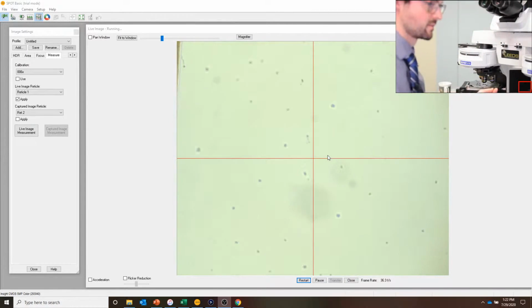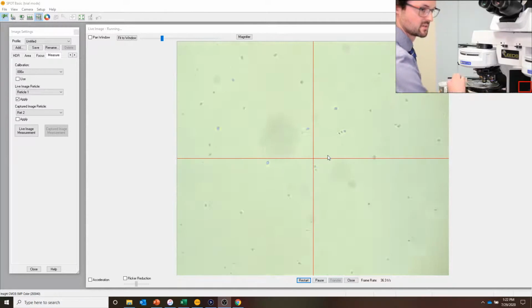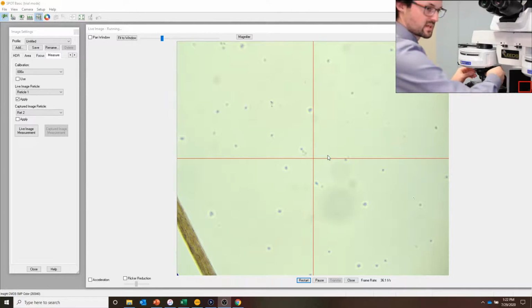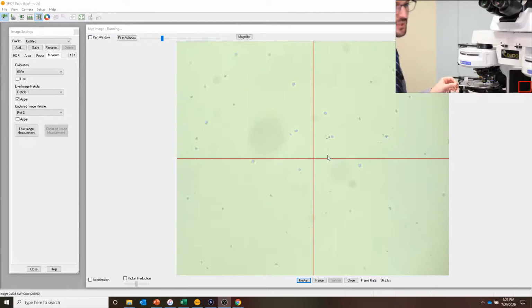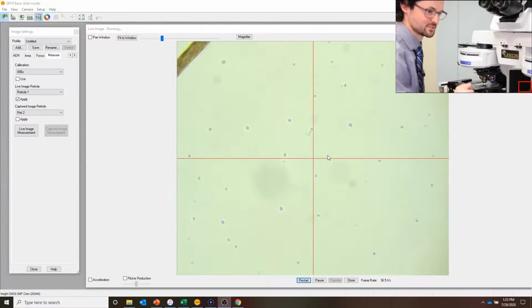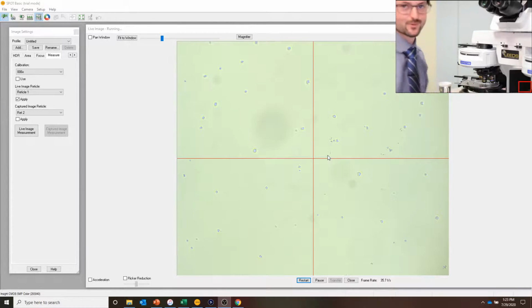And so now, not using the centering screws in the back, but using the centering screws on the nose piece that I've inserted, what I'm going to do is try to get into the middle of that circle. Maybe I overshot a little bit, but we'll see. It's definitely better, and you can tell that when you get things locked up, it just feels really good. It just sinks. All is right in the universe. I'm not saying all is right now, but we're getting close.